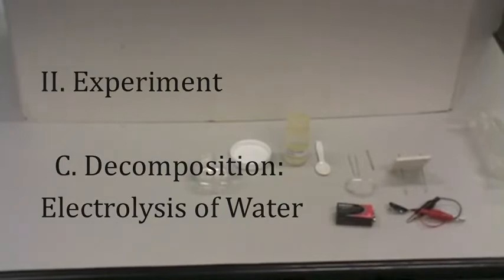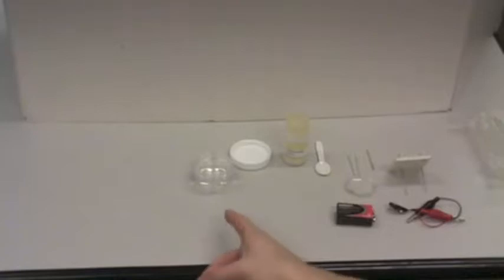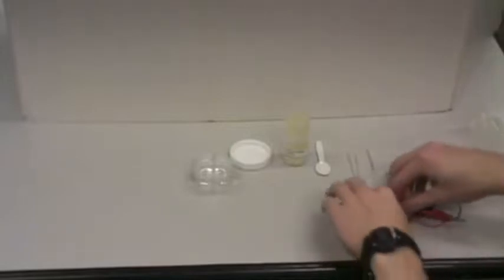Demonstration. Take the 9-volt battery, wire leads, and a set of nickel electrodes from the demonstration bag. From the plastic container, take 1 jar of distilled water. Show the students how to hook up the set of nickel electrodes to each wire by attaching the alligator clip to the short end of the electrode.